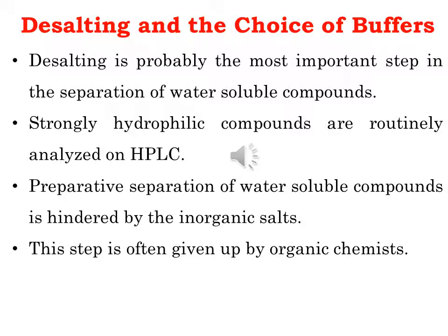Desalting and the choice of the buffer solution. Desalting is probably the most important step in the handling of water-soluble compounds. It is not necessarily difficult to fractionate the water-soluble compounds to a single chromatographic peak. In fact, strongly hydrophilic compounds are routinely analyzed on high-performance liquid chromatography, that is the HPLC, without any trouble. However, what makes the preparative separation of water-soluble compounds so difficult is the separation of inorganic salts, often from minute amounts of the target molecules.